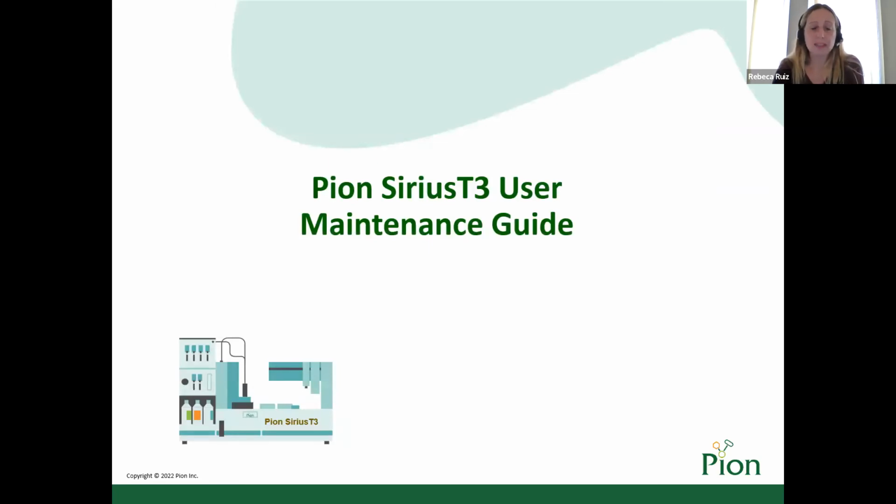To finish this presentation, I would like to comment on the application note, the Pion Sirius T3 user maintenance guide.